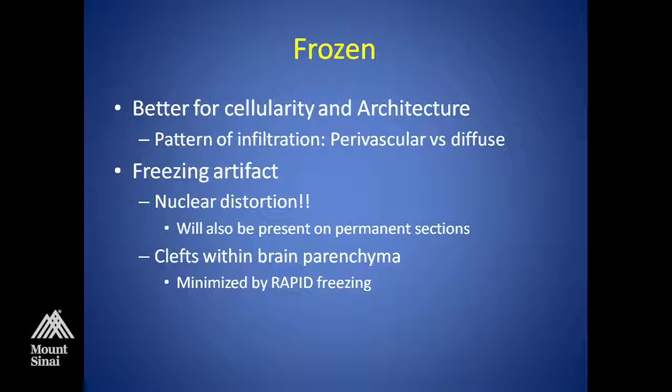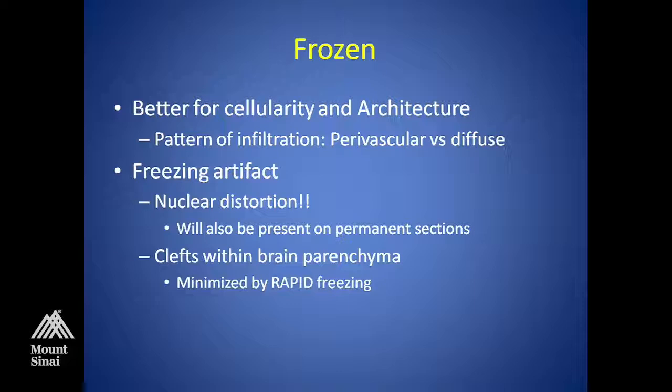Frozen sections, on the other hand, are typically better for assessing cellularity and architecture of the tissue and pattern of infiltration — whether the cells are predominantly in a perivascular arrangement, diffuse infiltration, or both. Freezing artifacts, however, present a problem. If the tissue is not frozen quickly, you get a lot of nuclear distortion and clefting of the brain parenchyma, which makes it difficult to read.